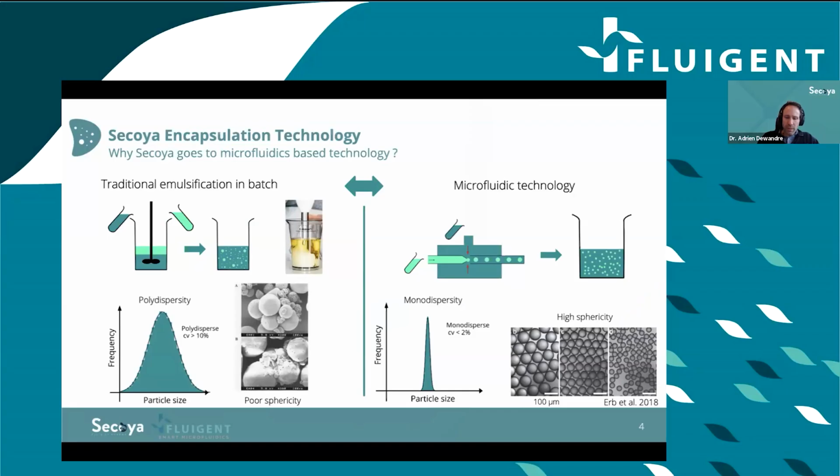The particles typically present a large size distribution and a poor sphericity, which is of course not ideal for a precise loading. And of course, this technique of fast stirring is not compatible with cell encapsulation.